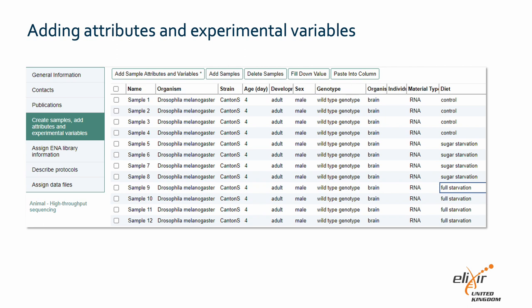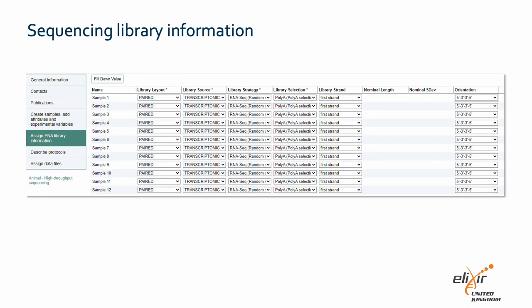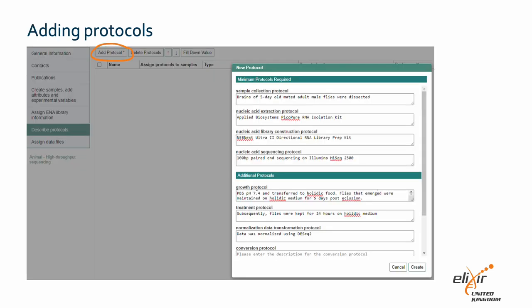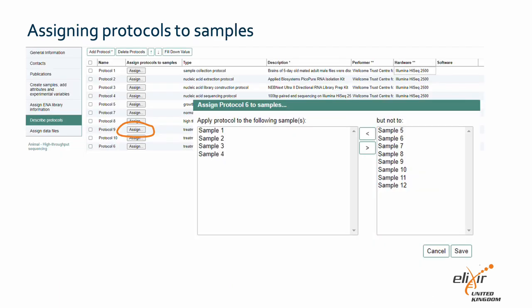Pressing OK will generate a table with your chosen attributes, which you can now populate for all samples. Note that in our example, all attributes are the same for all samples, but the experimental variable — diet — is different. On the next tab, we will be providing information about the actual sequencing libraries. Please provide as much information as possible. Next, we need to describe the protocols used to produce the data. Click the 'Add protocol' button and a pop-up will appear with fields for you to complete. Once you have done that, you can assign protocols to your samples. In our example, most protocols are shared between all samples. However, we have three different feeding protocols that are different for the controls, the sugar-starved flies, and the fully starved flies.